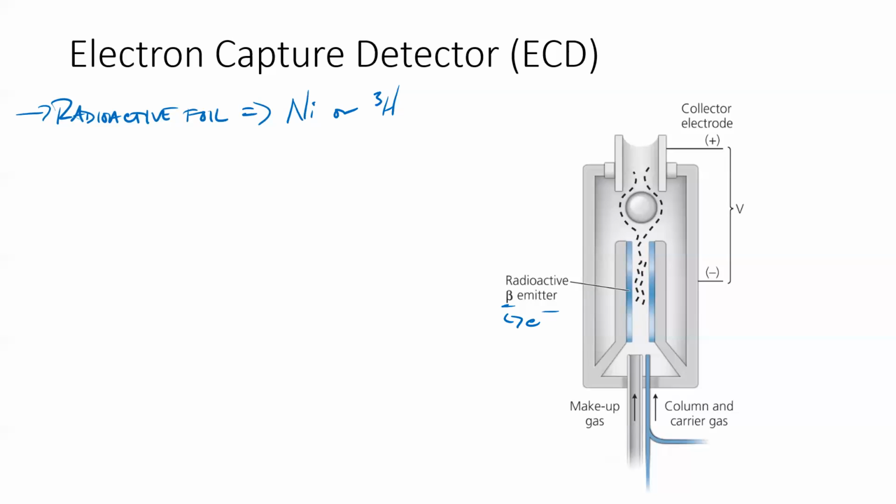And so we have these electron emitters, essentially. And so they're constantly giving off electrons, even when our analyte is not flowing through. And so there's some background current because those electrons can ionize the carrier gas, depending on what it is, right? Helium's not very ionizable, but if you had nitrogen or neon or argon or something larger than helium, you'd get sort of this background level current.